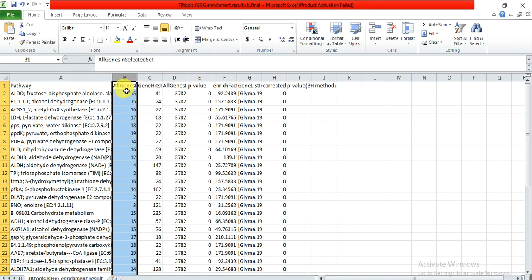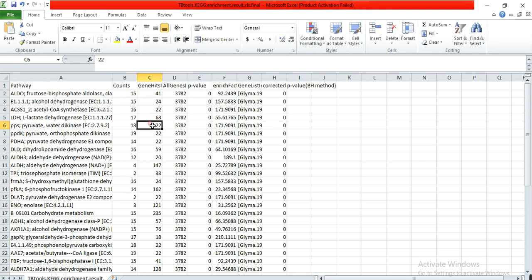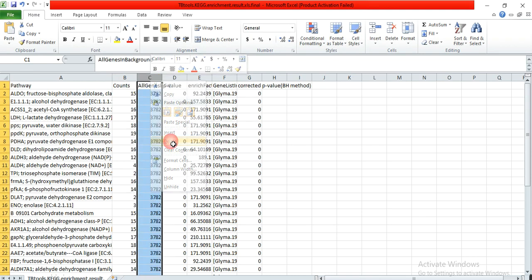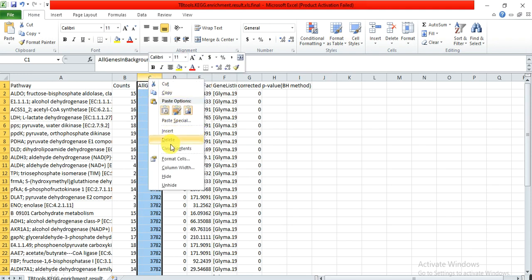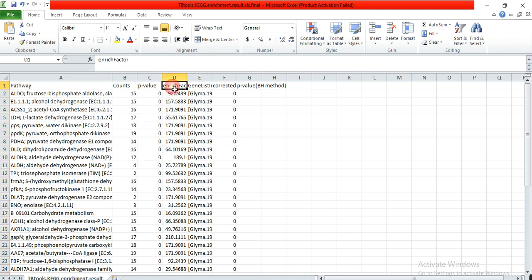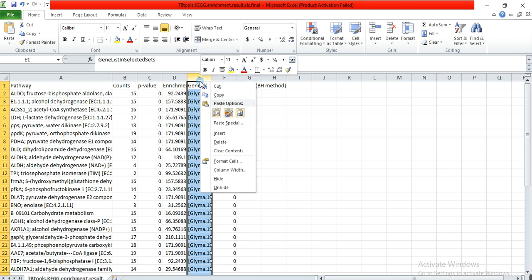We name it 'counts.' Here is the gene hits background - we didn't need this, so delete it. All genes in background - we didn't need, so delete it. This is the p-value, and this is the enrichment - yes, we need this. We name it 'enrichment.'